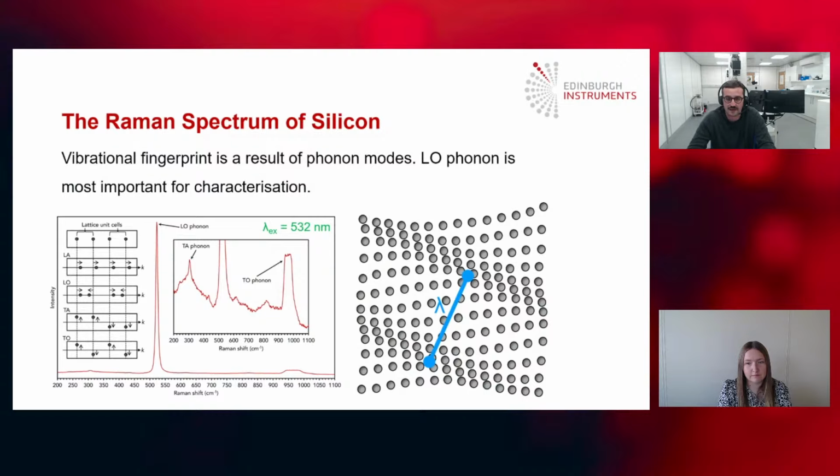So in semiconductors, Raman modes occur through the inelastic light scattering by phonons, which are the elementary excitations and the quantum mechanical treatment of crystalline lattice vibrations. So what does that mean? The image on screen kind of shows that. That shows a phonon mode on the surface of a crystal. So when the atoms within the lattice undergo coherent oscillations, a vibrational wave propagates through the crystal.